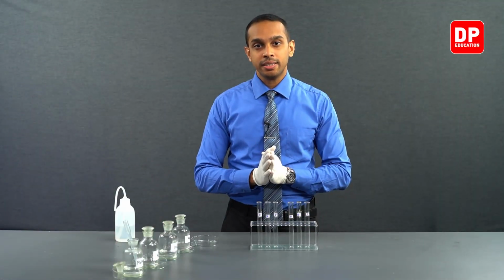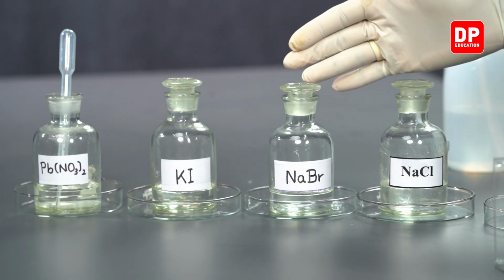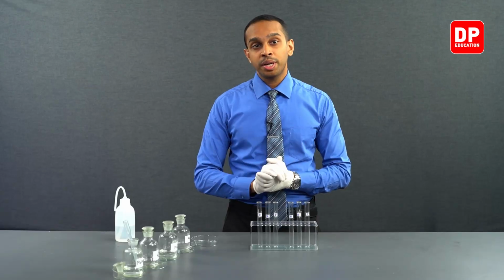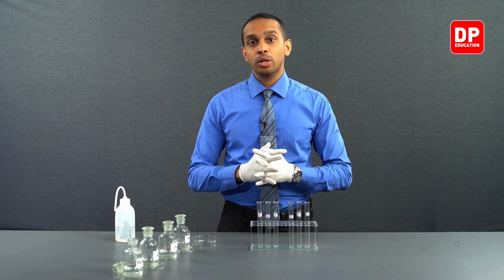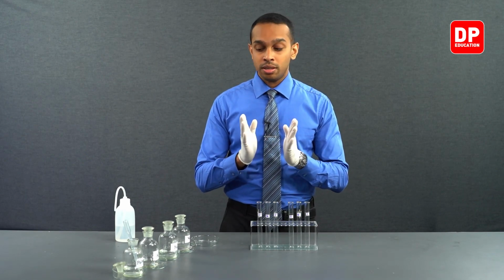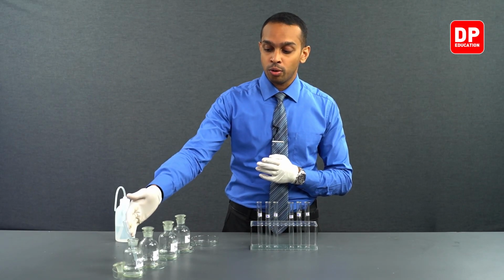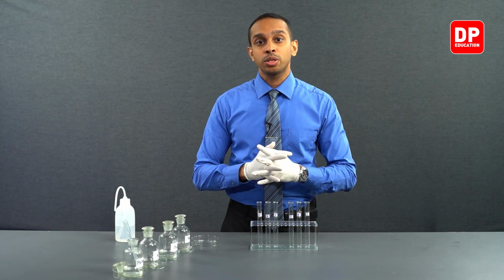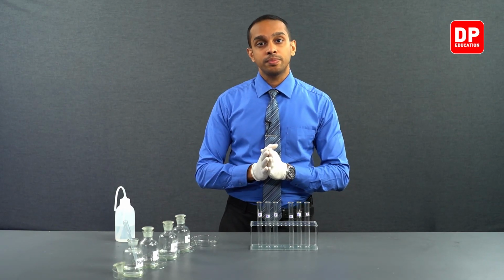Let's take a look at how sodium chloride, sodium bromide, and potassium iodide will react with lead nitrate. Our practical book tells us that we have to use lead acetate, but instead we'll be going along with lead nitrate, because the purpose of using either of those solutions is to introduce lead ions into the medium.